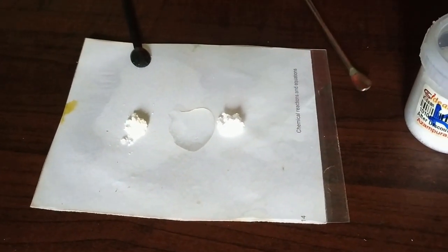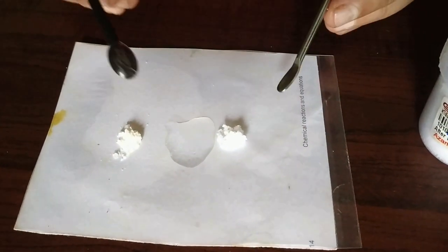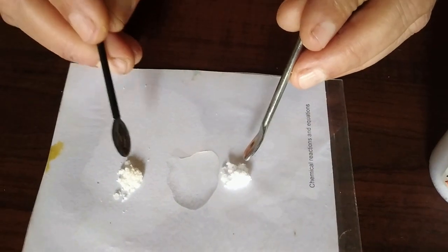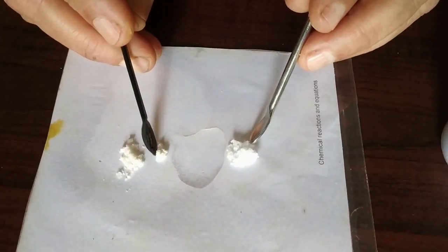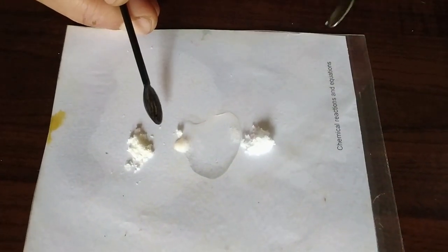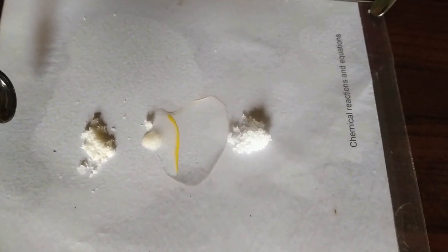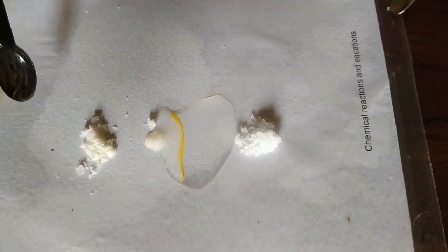Now we shall start pushing the chemicals into this little by little and see what happens. At the same time, I'll just push both. Even so much is enough, we don't need to take a lot of it. Now, lead nitrate decomposes into lead and nitrate ions. Potassium iodide decomposes into potassium and iodide ions. And all the four ions move.